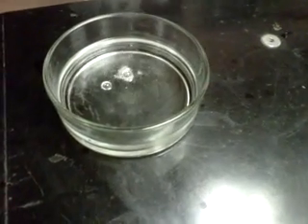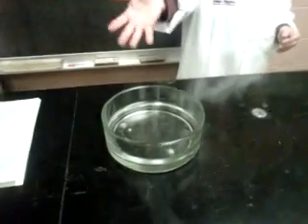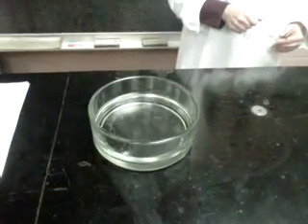Floating. Oh, you guys see that? It's floating. It's sizzling. Now watch out. What do you notice? This is a chemical reaction. So what do we see coming off there? Smoke. And what else do you see happening? Bubbles. Sizzling. Moving around.